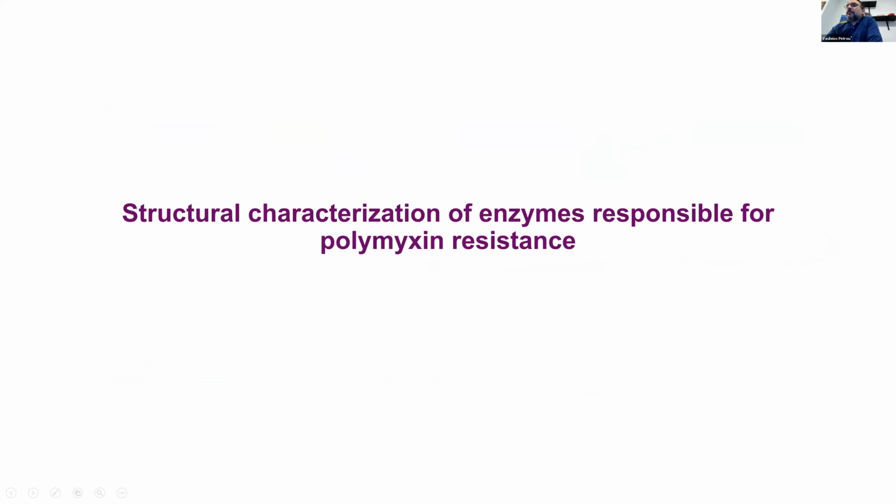So first, I'm going to tell you about essentially one of the main focuses of the lab, which is structural determination of enzymes that are responsible for polymyxin resistance.